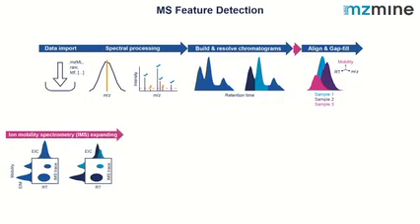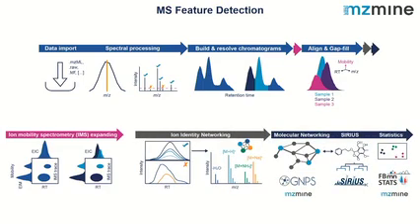And because it's a modular system, we can then easily plug in some more modules for ion mobility spectrometry. And we can also plug in some modules for ion identity networking, where we try to find all the different ion adducts of the same molecule. And we can also do downstream analysis in molecular networking, which we're going to look at, and statistical analysis and so on. But the main goal of the first approach is that we generate an aligned feature list. And the alignment really happens on all the different properties that we have in your data set. So maybe ion mobility, m/z, and retention time.